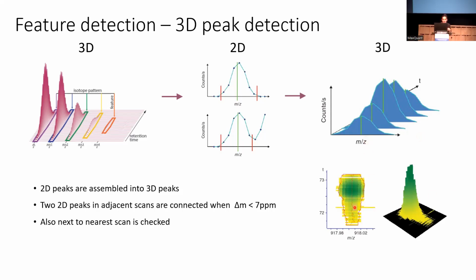So as you can see here, now this is in 3D, and this is the same plot, but looking at it from above. And again, the color tells you the intensity. So what happens here, if you see the red outline, is actually what I wanted to do in the beginning. I told you in the beginning that I want to have the rectangles, these color rectangles, right? And actually these are the rectangles, the red outline here.